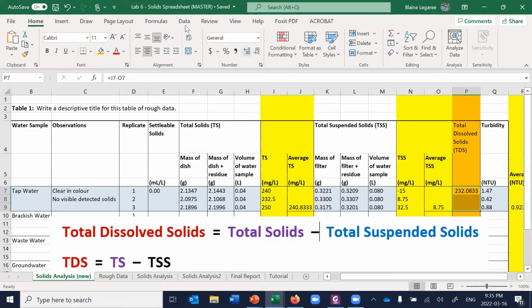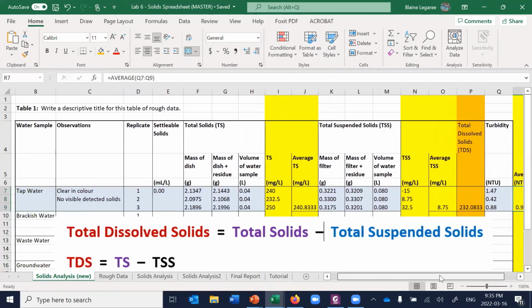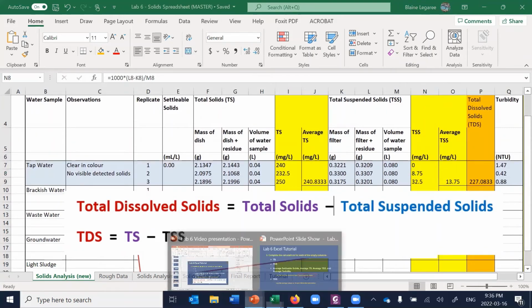I'm also going to merge these cells as well. Like I said, it's going to save us a little bit of grief later on when we're putting this thing up. So one thing I want you to do at this stage, if you have any negative numbers, like right here, for example, let's actually change it to a 0. Okay, so we'll proceed on to the next step.